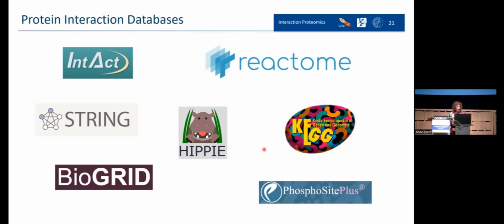So fortunately, we have online repositories. Here are some of them that you can use. I honestly prefer STRING, but it's just that I find the interface very nice, and I like very much the colors that we have. But I don't see any reason why you shouldn't use any one of these other repositories. They're all as good as the others.